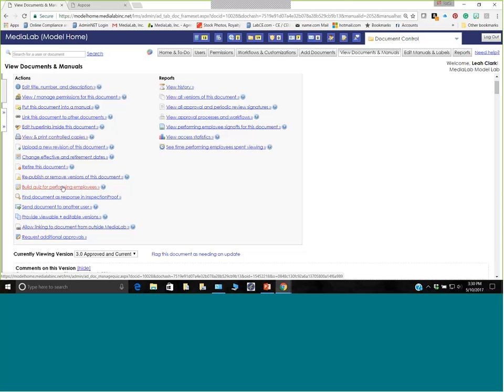This is where you'll build quizzes. So I talked about that a few minutes ago. If you wanted to build a quiz on an SOP for your staff or even on a change that you've made, it's really great to be able to have that functionality, and that feature lives here in your actions menu.